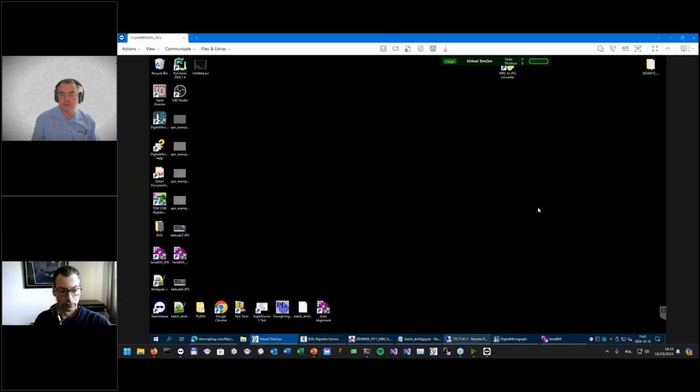So Bart, with the TemReporter software, what needs to go on the microscope in terms of software? Obviously, you've got the software on your iPhone, but what do we need to do on the microscope side? Right, so in order to make TemReporter running on your microscope, you need a client, a dedicated client. This is a piece of software that we provide. Basically, it's a small executable that, well, let me show my screen actually again.